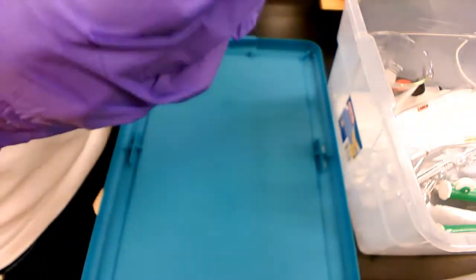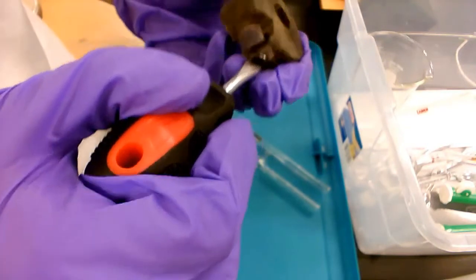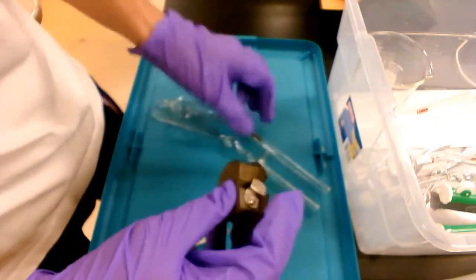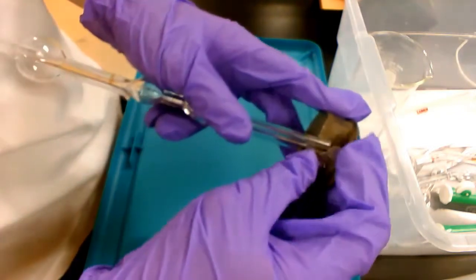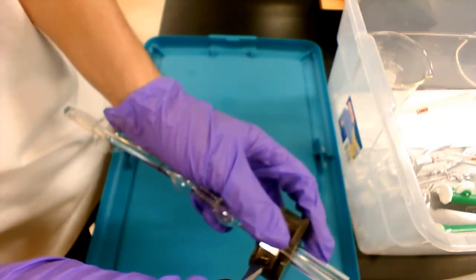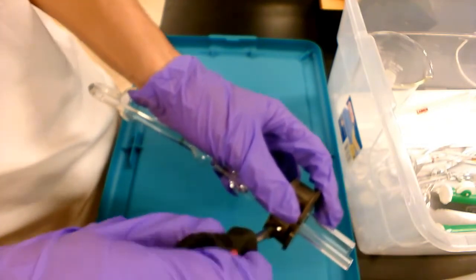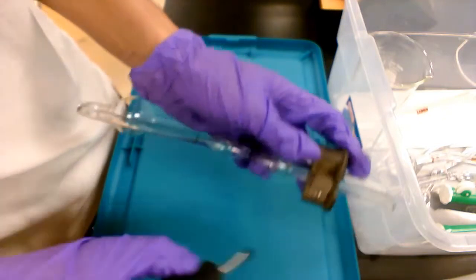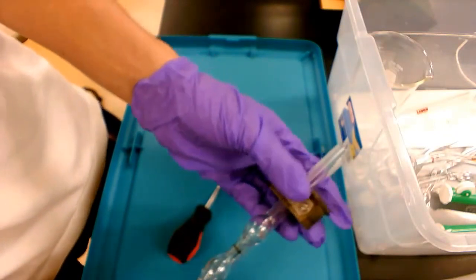To set up the viscometer, you need to use a screwdriver to first unscrew and loosen this part, then fit the viscometer into the holder as seen over here. Next, tighten the holder on the viscometer by turning the screw clockwise. However, it is very important not to over-tighten the screw, otherwise you risk breaking the viscometer.